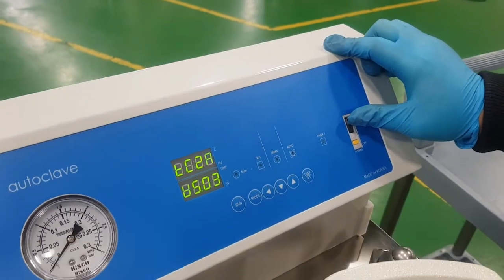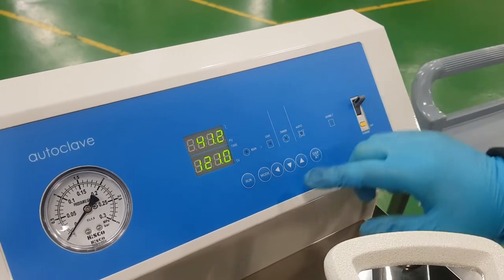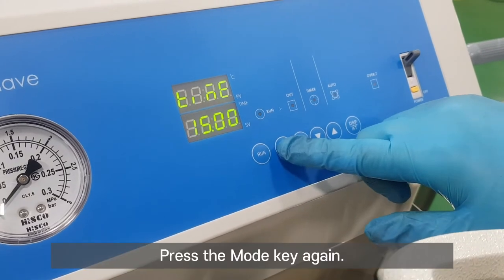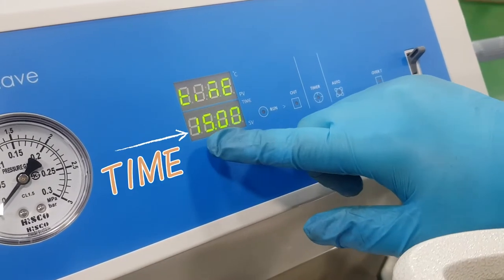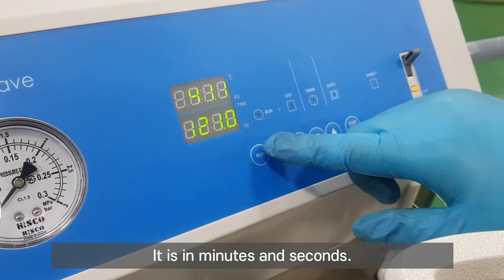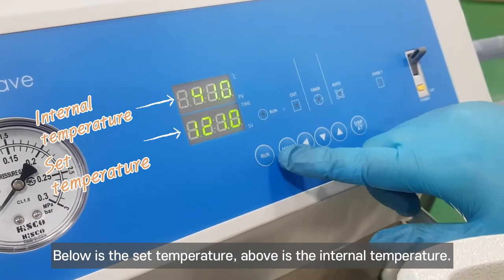Power up. Press the mode key for temperature setting. Press the mode key again for time setting. It is in minutes and seconds. Below is the set temperature; above is the internal temperature.